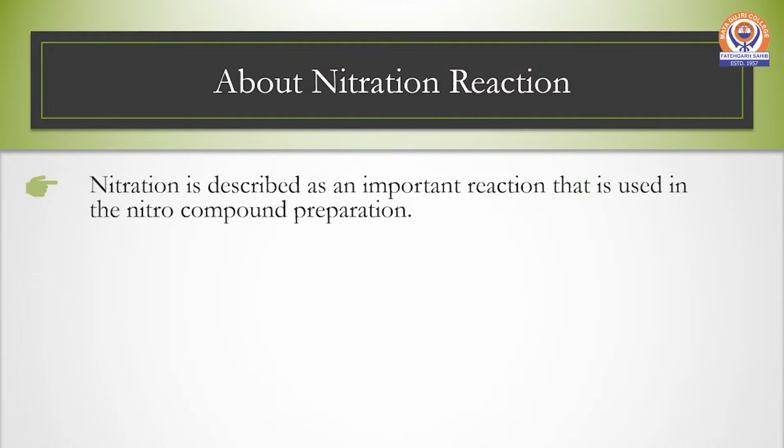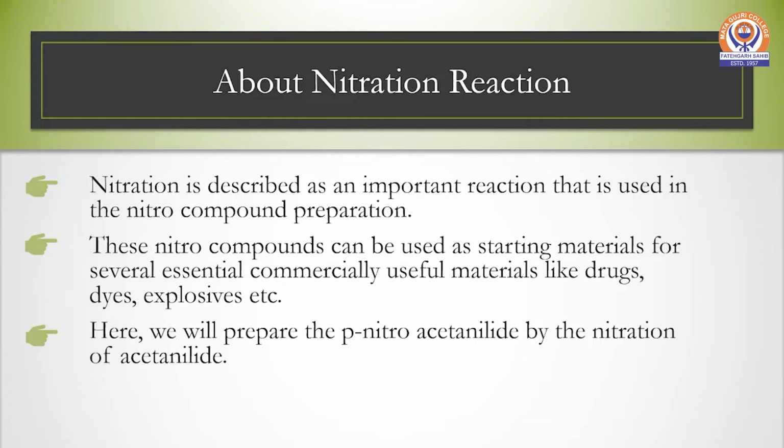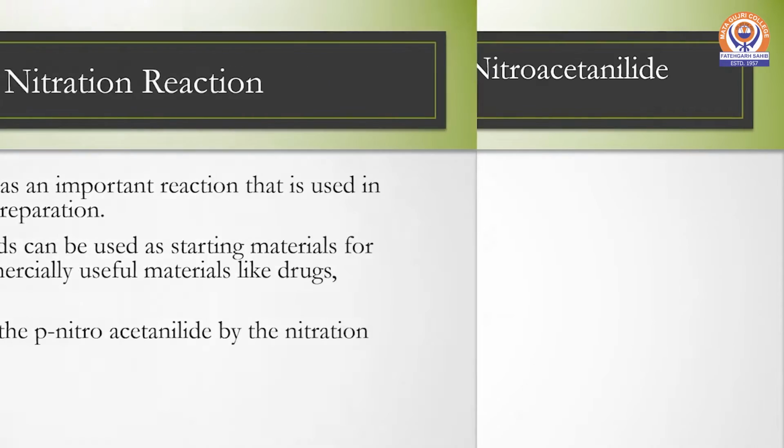Nitration is a common and important reaction used in the synthesis of nitro compounds. These nitro compounds can be used as starting material for various essential commercially useful materials including drugs, dyes, explosives, etc. Here in this experiment, we will be synthesizing para-nitroacetanilide by the nitration of acetanilide.